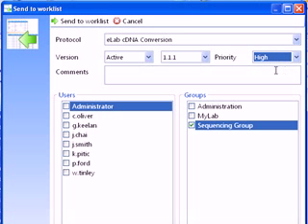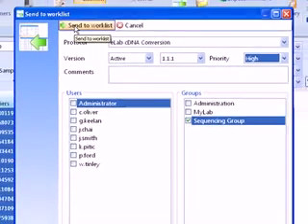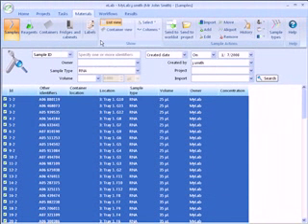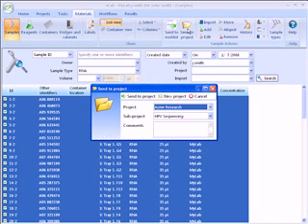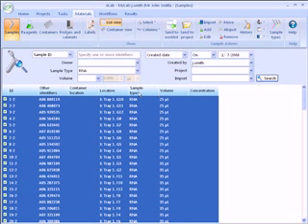Modify any other settings and send the samples to the work list. Similarly, we could have sent the samples to a project in order to manage the sequence in which your protocols would be applied to these samples.